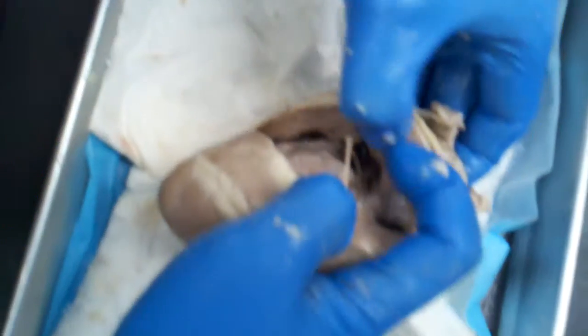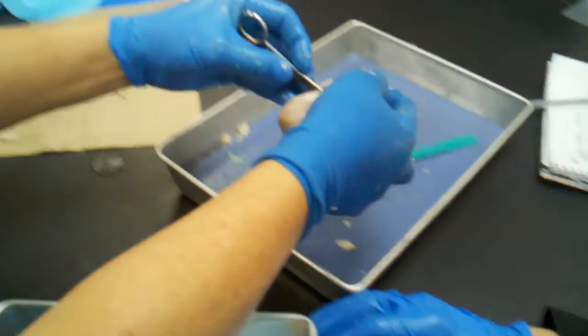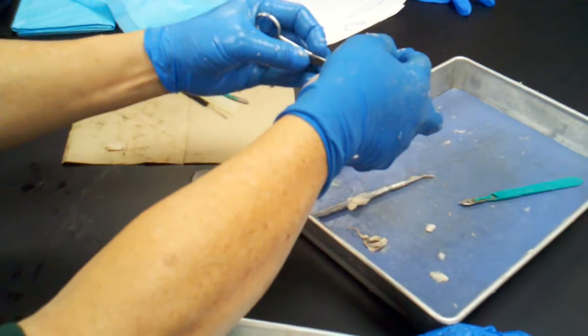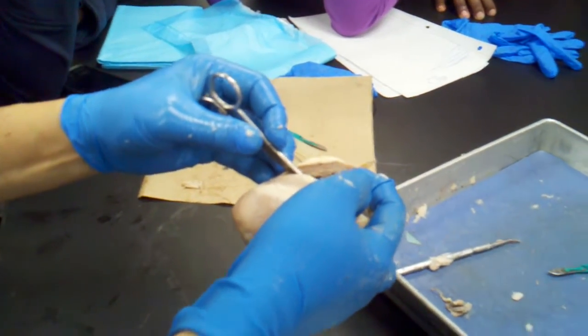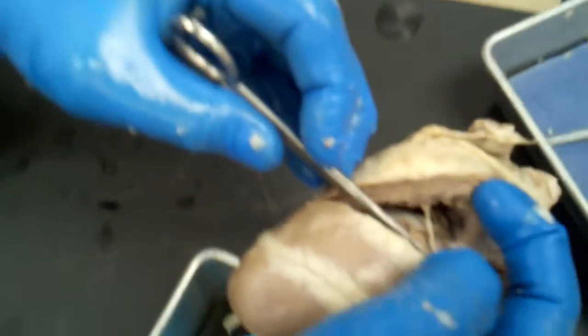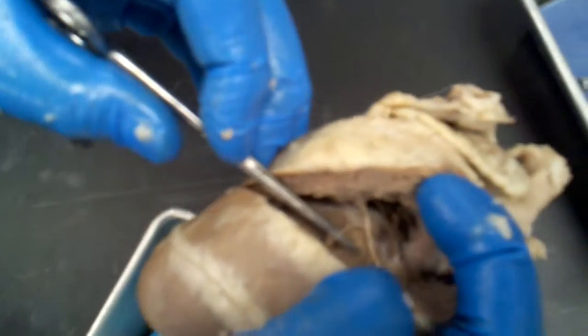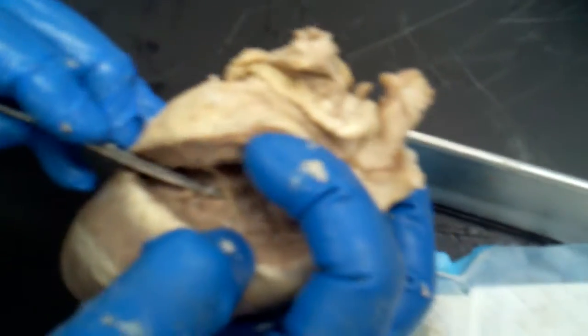Now, as I spread this apart, do you see little thin string-like tendinous material? Those are the chordae tendineae. And that is attached to a wider area that's membranous, which is the... Papillary muscle. No. Starts with a C, right? That's the right atrioventricular, oh, the tricuspid valve.